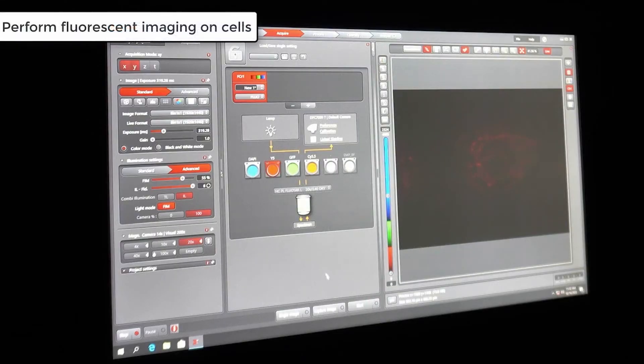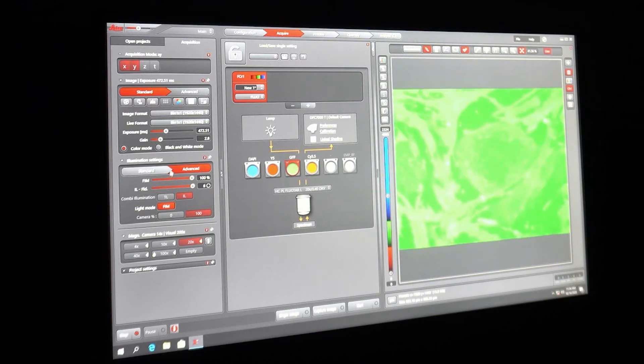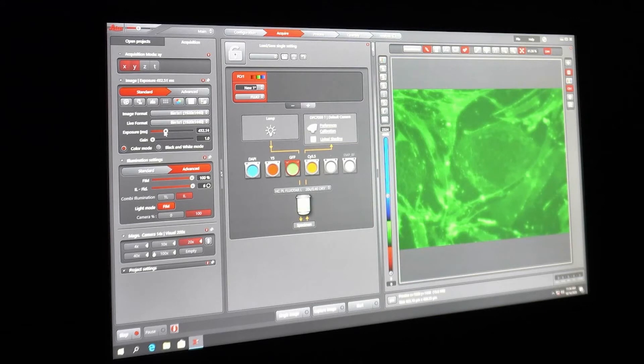The first antibody we are checking here is the TRA-1-60, the iPSC marker. Adjust the exposure and gain so that you can clearly see the iPSC cells. Take care when doing this to avoid oversaturating the image. Once you are happy with the saturation and exposure levels, capture an image. Then check the GFP channel for the CD44 antibody. Using the same settings, this channel is very bright, so adjust the gain and exposure settings. This antibody should stain the MEFs but not the iPSC colony.